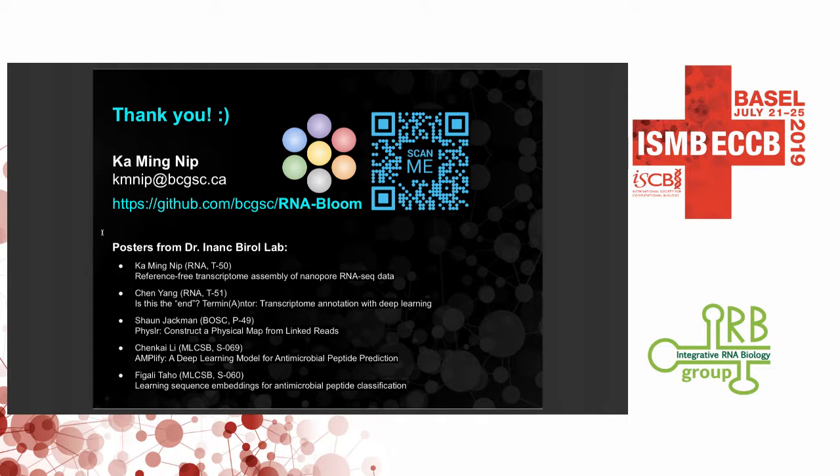So today I'll tell you about a method that assembles transcript isoforms from Nanopore RNA-seq data, but RNA-Bloom could also be used for Illumina bulk RNA-seq data and also single-cell RNA-seq data, which I have actually given a talk about last year in ISMB.